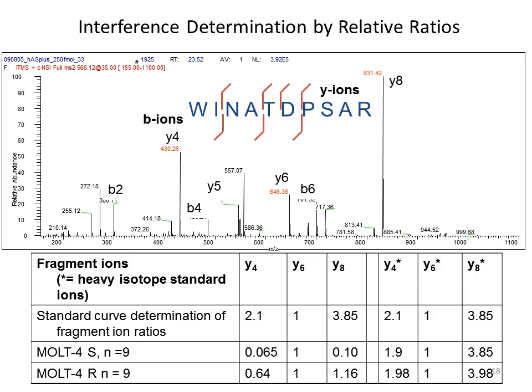Okay, so going back to fragmentation and relative ion ratios. This is what I was trying to describe for the dot product part. When you fragment a peptide, this is an example of this one up here, you get these ions, and their intensities should be relative to one another, the Y8 to the Y4, the Y8 to the Y5, the Y8 to the Y6. That should really be consistent every time you monitor them, as long as they're above the limit of quantitation.